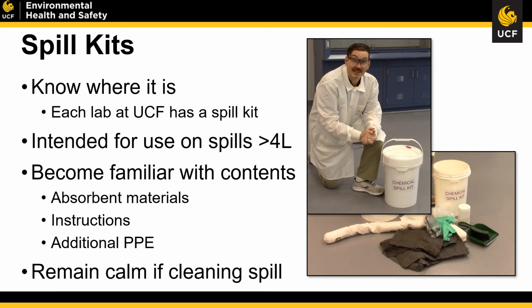You'll have an instruction sheet and an inventory list within the spill kit. In the event you need additional PPE, that will also be contained within your spill kit. That will include spill goggles as well as large rubber gloves and an apron if needed.